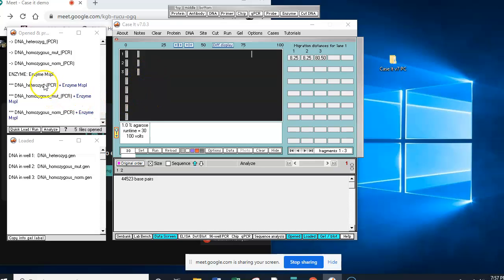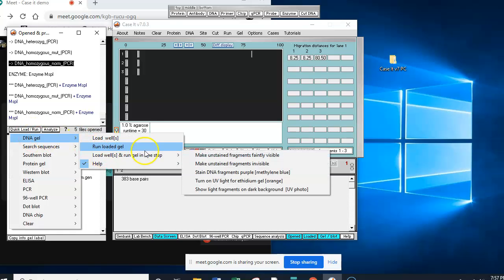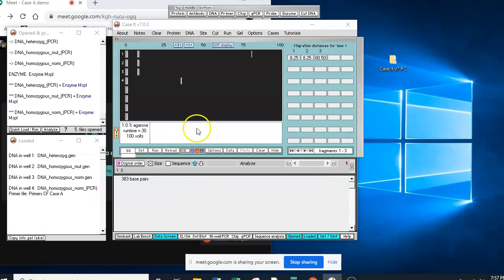And then if we compare that to like a PCR product, the PCR product runs down here. I don't know what the heck that is. And so that's why we do PCR, because this is all of the DNA, and here we focused in on just one particular spot. So hopefully that's clear. And later on, when we do other techniques, you would just do other things.